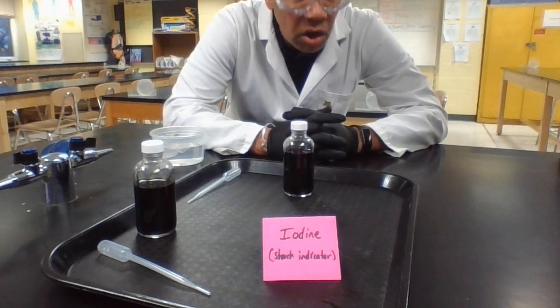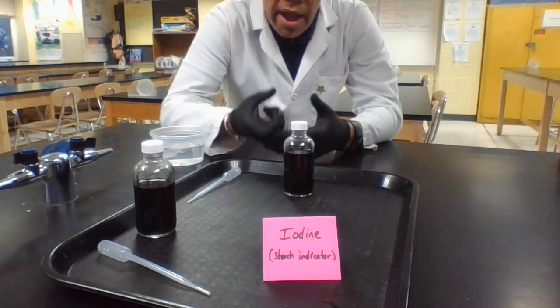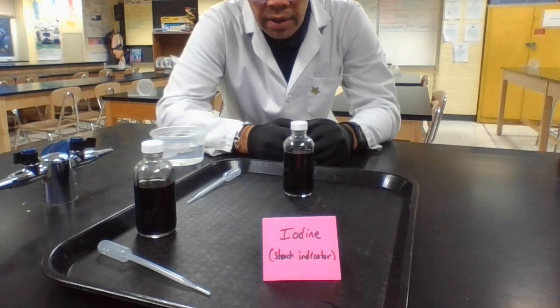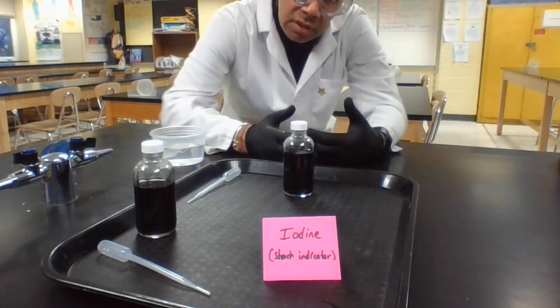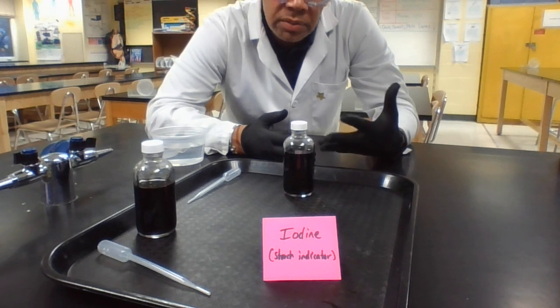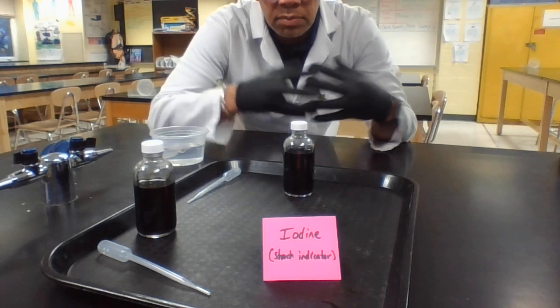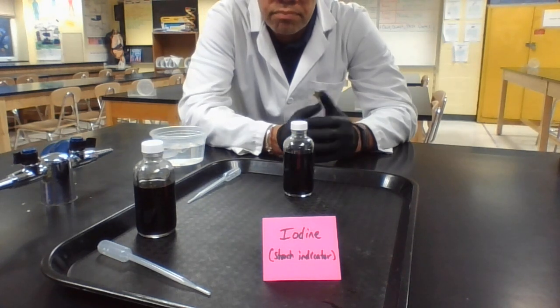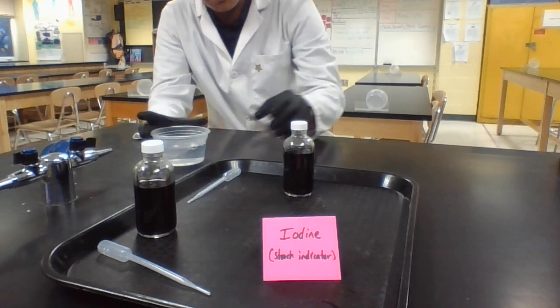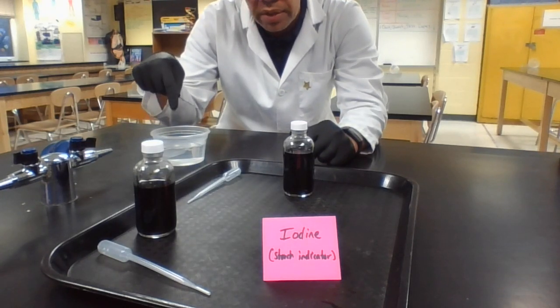Iodine, when it touches starch, turns purple black, okay? And so if you were to take a cracker, like our graham cracker yesterday, which has starch in it, and you drop some iodine on it, it should turn purple black. Even paper has starch or complex carbohydrates in it, like cellulose and other materials that turn purple black when it touches. Basically, if it comes from plants and it has multiple sugars bonded together, it should turn purple black. So what we're going to do is we're going to put iodine drops into this water on the outside.